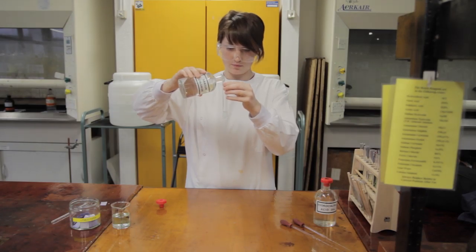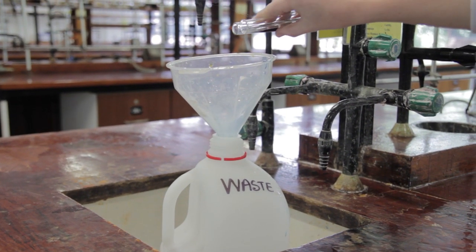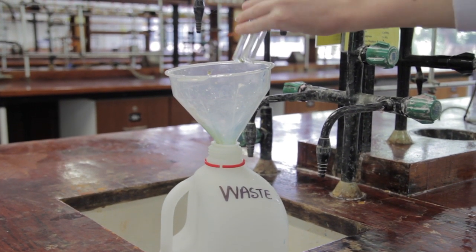Waste disposal is very important as you are working with unknown chemicals, so they must not be poured down the sink. There is a waste bucket on each sink where your waste will be poured.